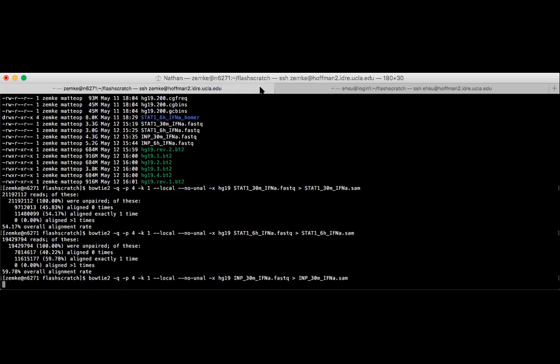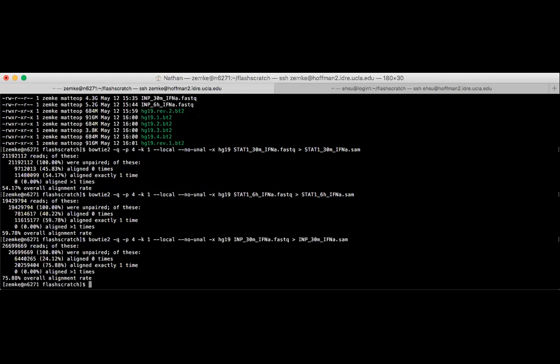I see a lot of people are leaving. Hopefully that means that people were able to finish doing the alignments. I'm still on the third one, but it will probably be done soon. And there's just one more. Feel free to go if you have the alignments done, but if you need help, I'll stick around until my last one finishes and you can ask questions. Otherwise, I'll see you guys tomorrow. My third one just finished.